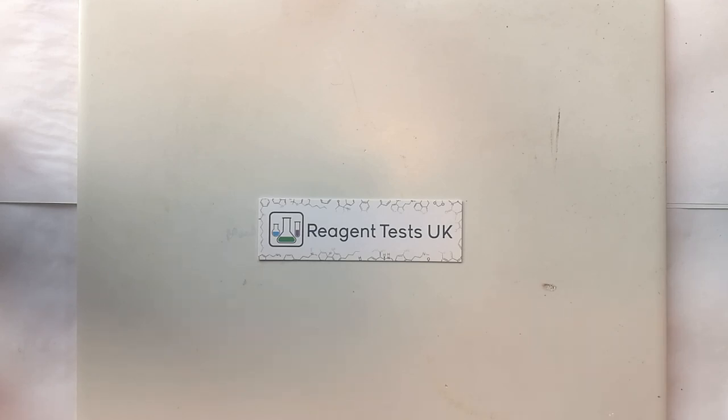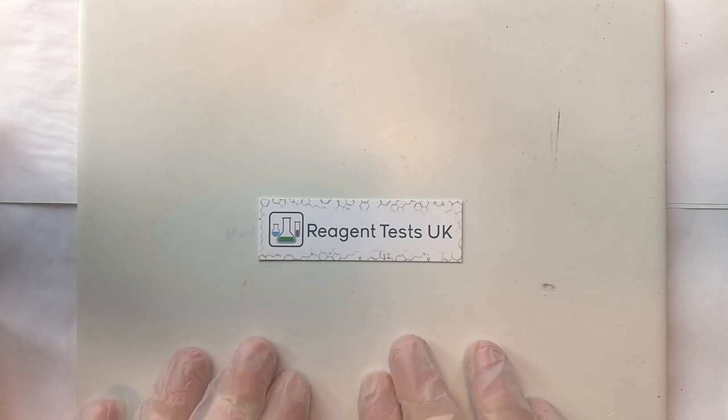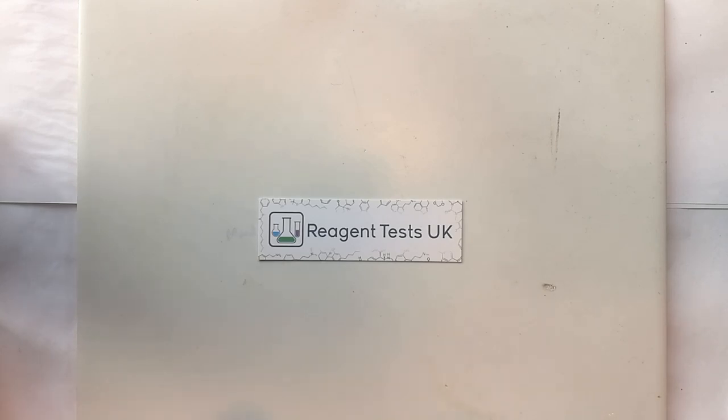The area that you're testing in needs to be prepared before you start. Put some paper down on the table just to protect the surface because the reagent tests will stain the surface if they touch it. The area needs to be fairly well lit so that you can see the colour changes from the reagents. And you'll need a white ceramic testing surface. The reason for this is because it's chemically resistant and it's very easy to clean. Once you have cleaned it with hot soapy water it also needs drying thoroughly because water will interfere with the tests.